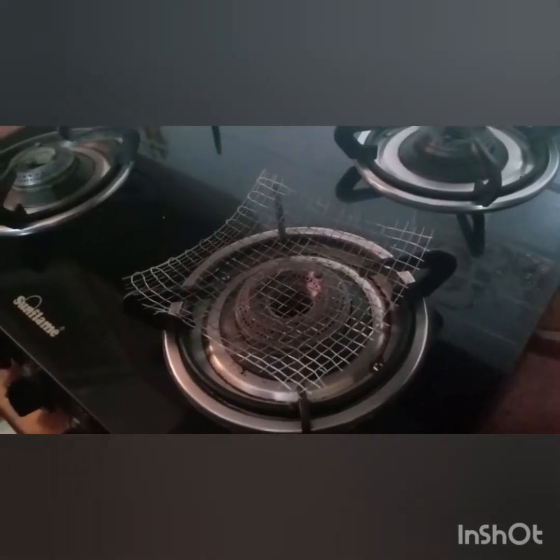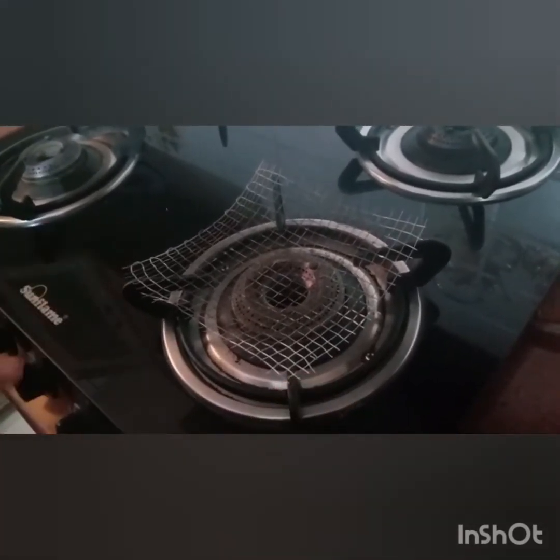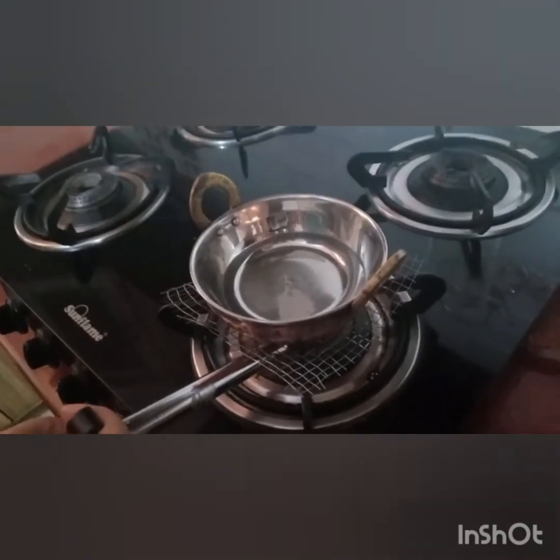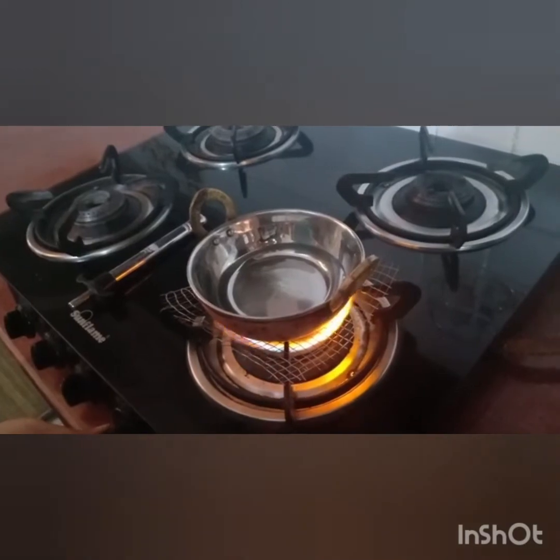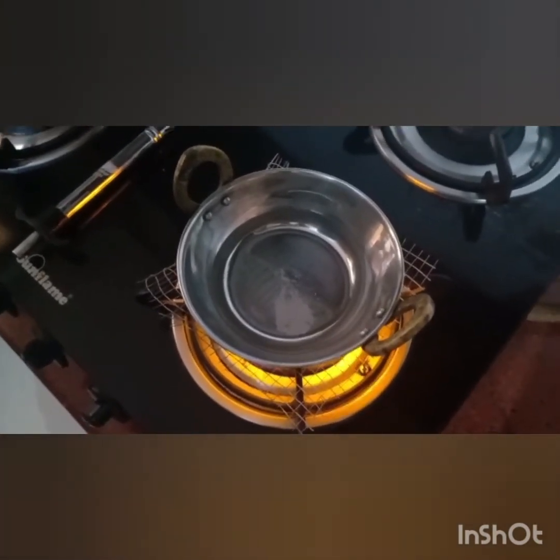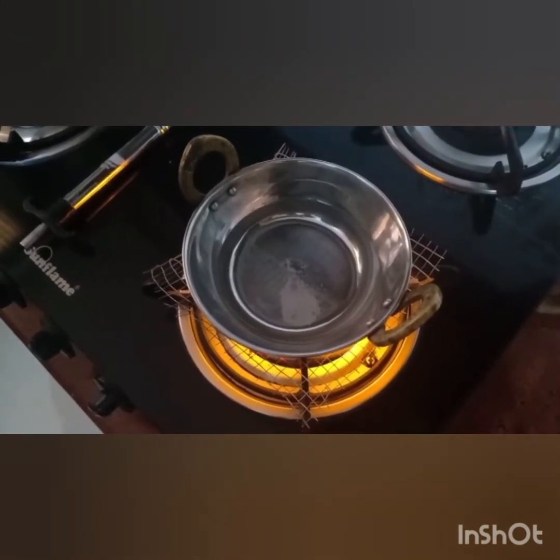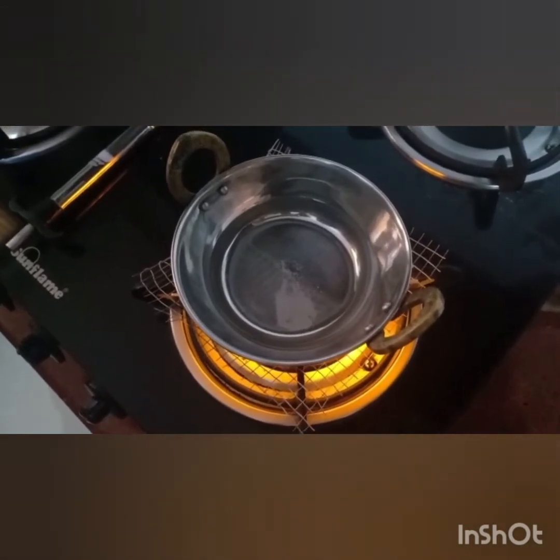Now we need to set the apparatus for heating. So I need a burner for this, the wire gauze. On the wire gauze we keep the evaporating dish. And now I will start the burner. So we'll start heating this. So the salt has completely dissolved into it, and after some time it will start boiling. While boiling, the water evaporates and the salt remains behind.